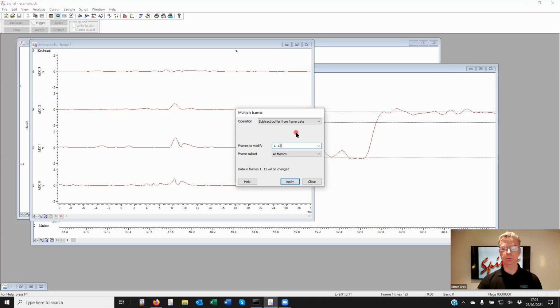It's not something you do using virtual channel. You can do it using a buffer. It's destructive to your original data, so be wary about that. And you might want to take a copy of your data just in case you get it wrong. Hopefully that's answered your question.